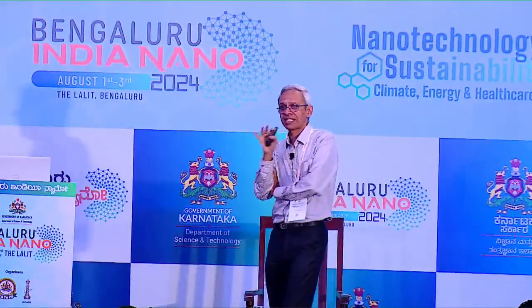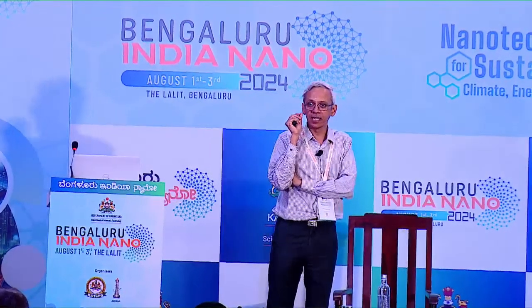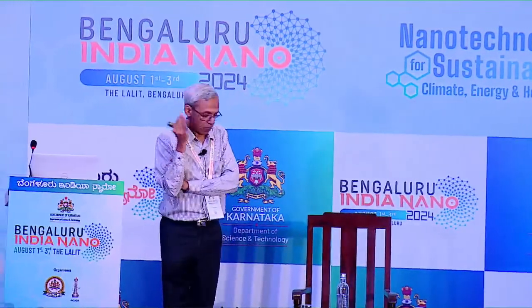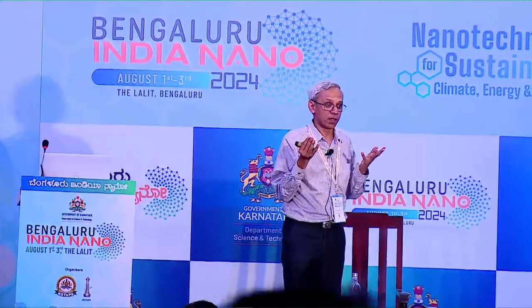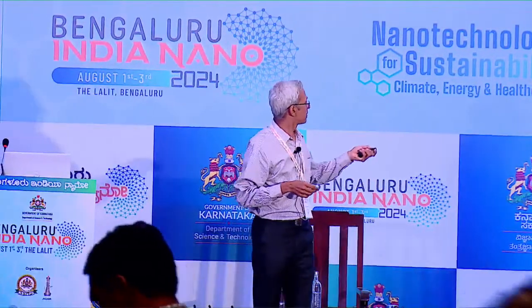So what is the transmission electron microscope? I just gave you the overview of what the electron microscope is doing. Although we talk of TEM as one technique, it actually comes in many forms, shapes, sizes, colors even. There are many different kinds of electron microscopes, each capable of doing a few things. When we talk TEM, typically it's almost like 25 to 30 different techniques rolled into one. It's very powerful.